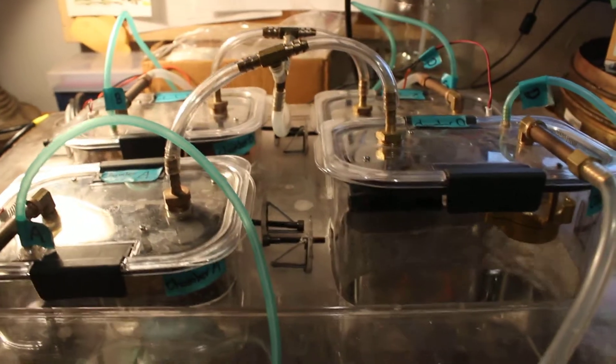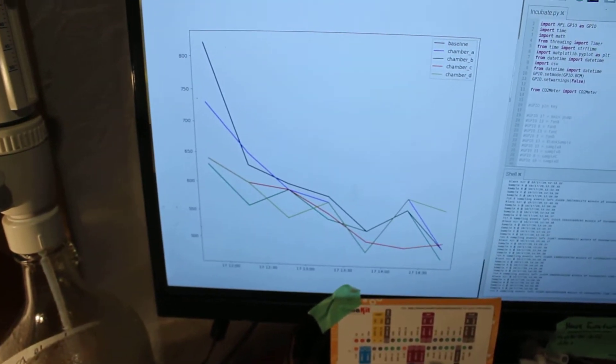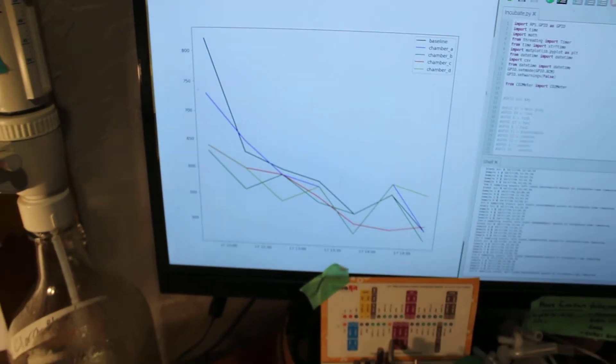So each chamber we can track the CO2 and that gets plotted here on this graph, live.